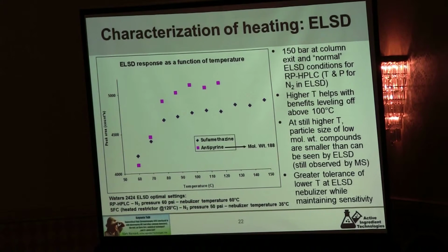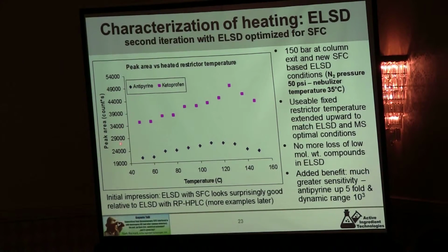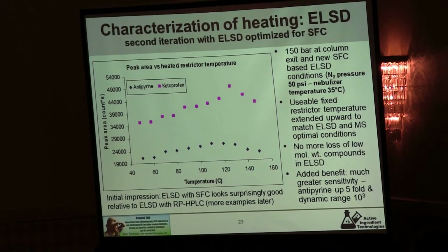But like many parts of this, we found that we needed to re-optimize, and where we needed to go is now back to the ELSD detector, because what were the right conditions at the detector were not the same for SFC and LC. What we can see is once we cool the ELSD down some and lower the gas flow some relative to reverse phase conditions, we're not dropping out that small molecule. And now we can measure an optimum also, and interestingly enough, that optimum appears to be right where it is for the mass spec detector too. It should be no surprise, our goal here is to form a really good aerosol. So both detectors want a good aerosol, and both seem to get it under the same conditions.